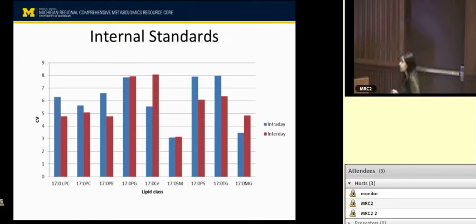Along with the basic QC, we give a Word document describing the method and a write-up about the whole process, including the sample prep, in the report. Plus, we give this Excel document for all the data and the data analysis that we do. The first tab is the data information, because when we get these samples, we give sample IDs internally to all of them, and the group information and all the other information submitted by the client is mapped to this. Then we give the raw data for each mode, both positive and negative.